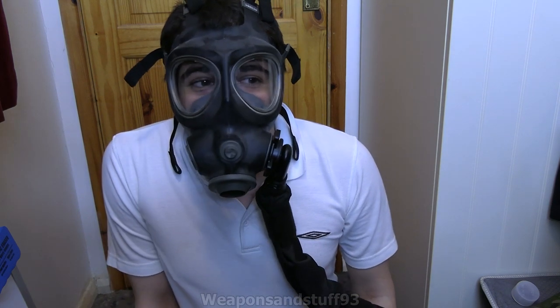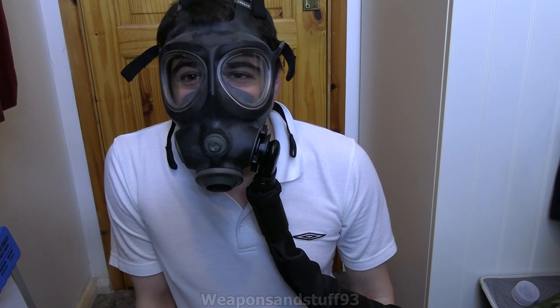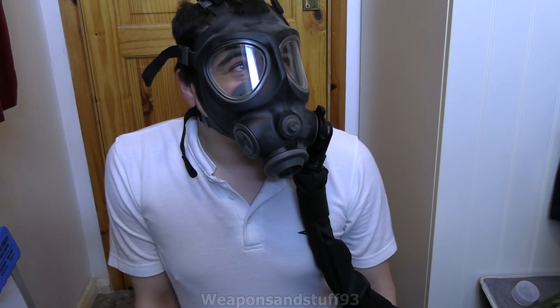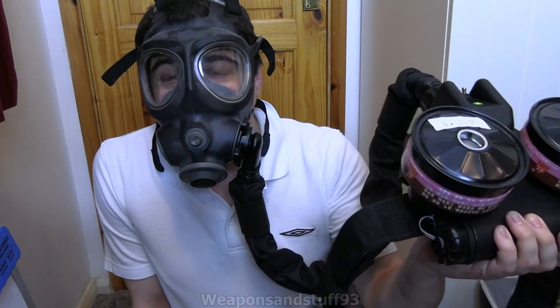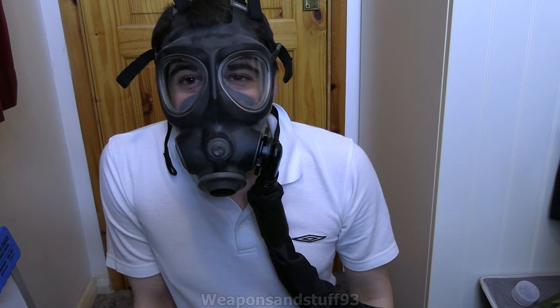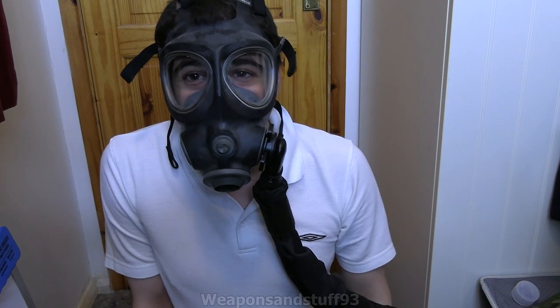That's a very good amount of airflow. What I'm going to do now is get out the Sieb Gorman mask that struggles to work with a lot of PAPR units — with the German unit I actually had to put it on full speed to be able to comfortably use it. But with this on, it's very comfortable, I can breathe easily with no resistance because it's doing it for me, and it's going through two filters not just one. The nice thing is the cool fresh air hitting you in the face, which is probably one of the nicest features of the PAPR unit.